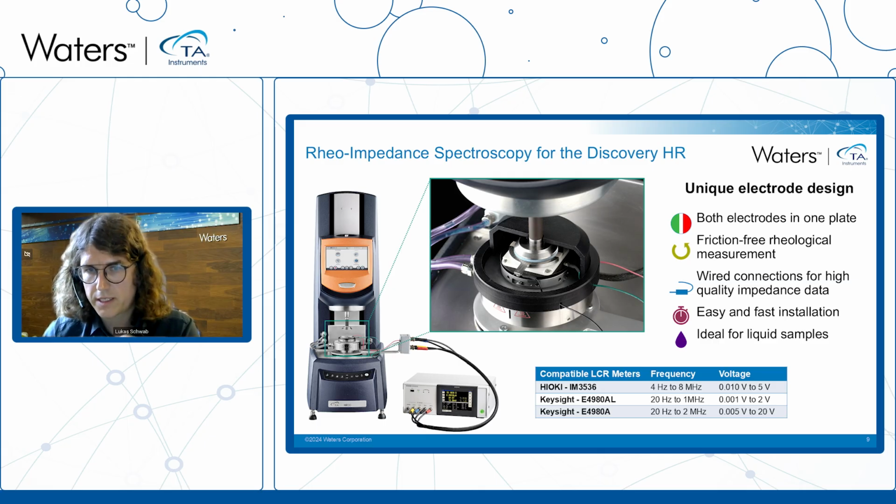Then with this setup, we can still use wired connections between the electrodes and the LCR meter. So we still get the best possible dielectric signal.